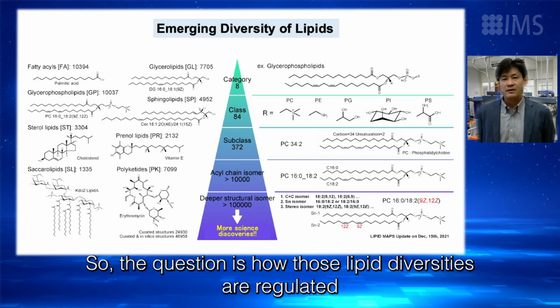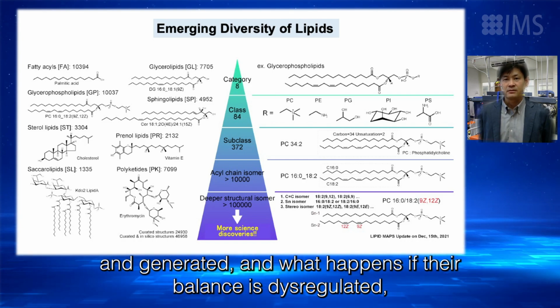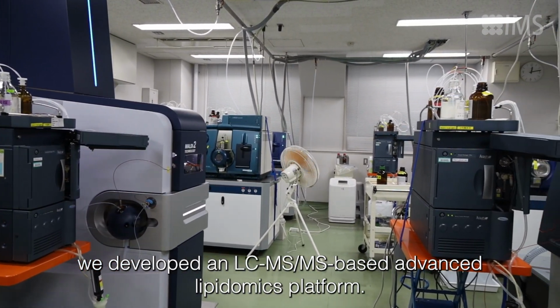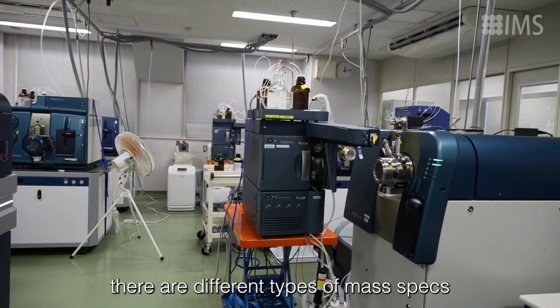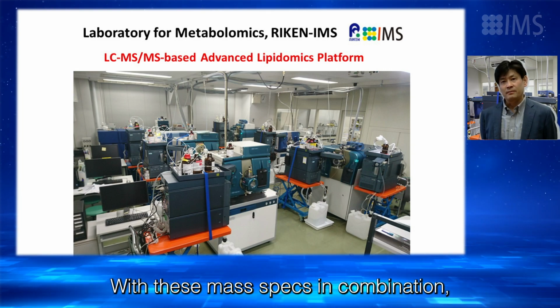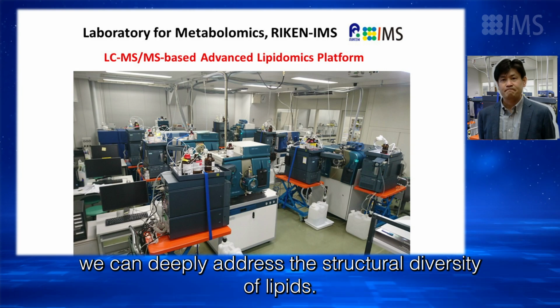So the question is how those lipid diversities are regulated and generated, and what happens if those balances are dysregulated, especially in human diseases. To address this point, we developed an LC-MS-MS-based advanced lipidomics platform. As you can see here, there are different types of mass specs, including triple quad MS and also QTOF type MS. And with these mass specs in combination, we can address deeply the structural diversity of lipids.